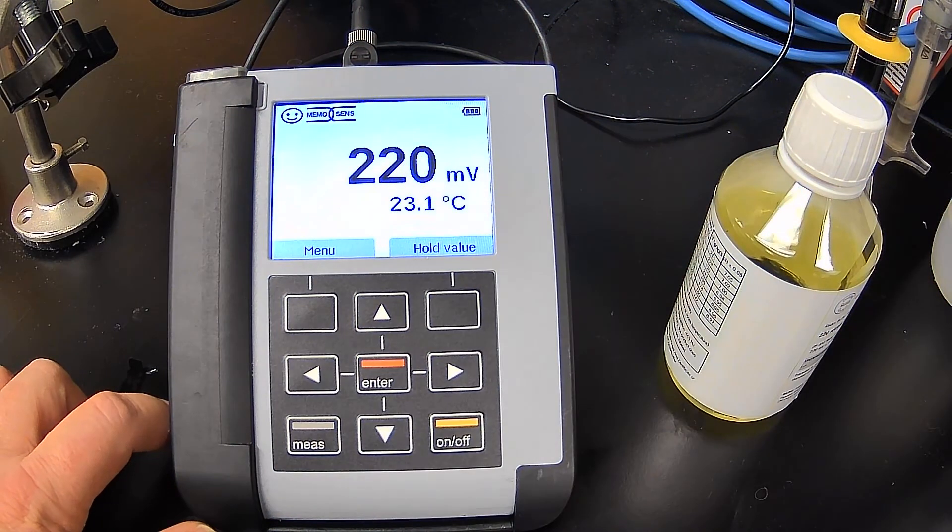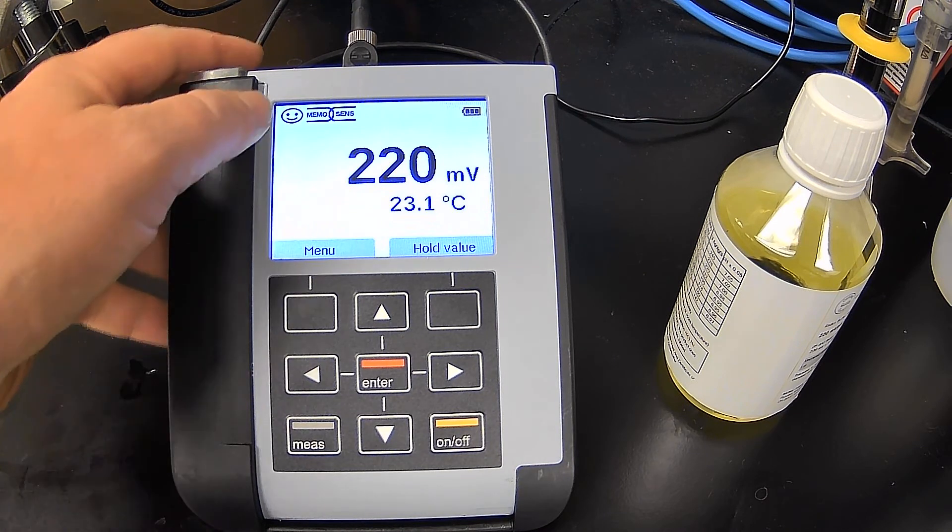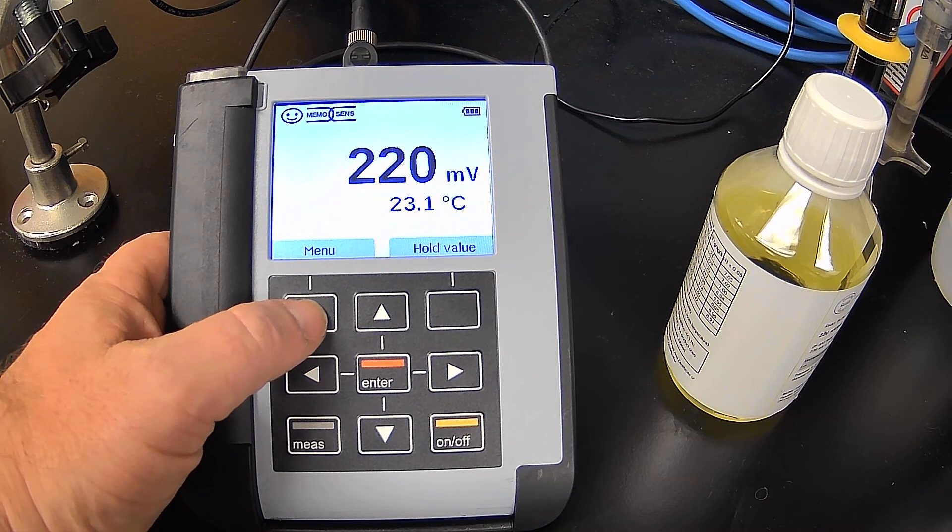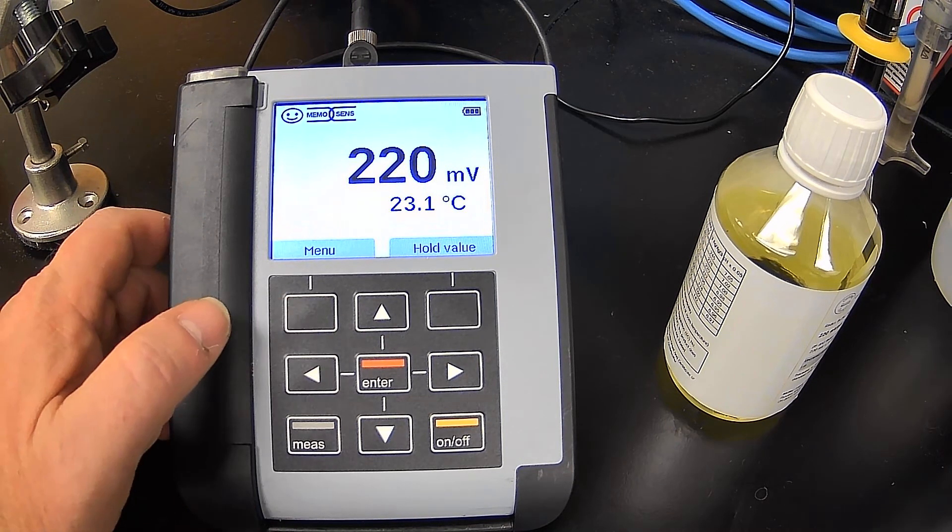There we go. So we're 220 millivolts. And we have our smiley, which is indicating that the calibration is good and there's nothing wrong with the electrode, nothing that would cause us any kind of a problem.